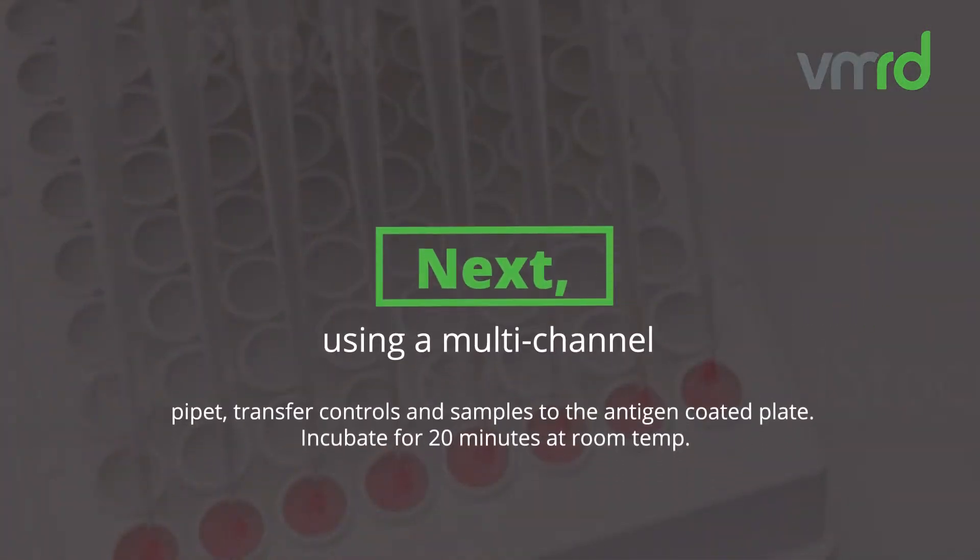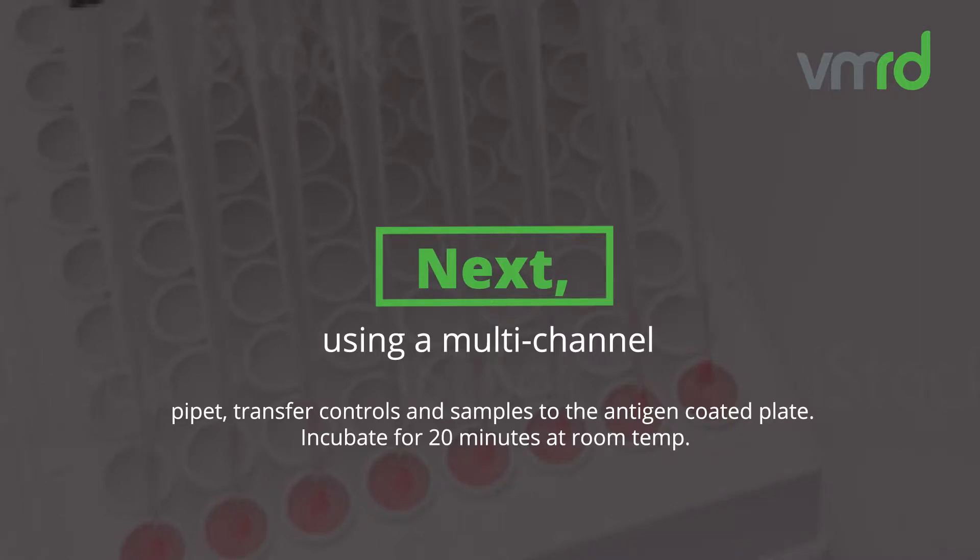Using a multi-channel pipette, transfer controls and samples to the antigen-coated plate. Incubate for 20 minutes at room temperature.